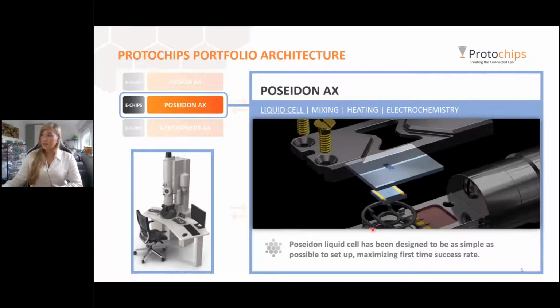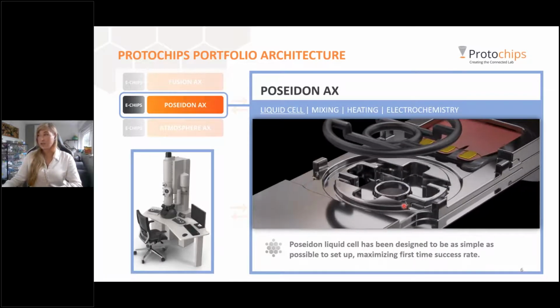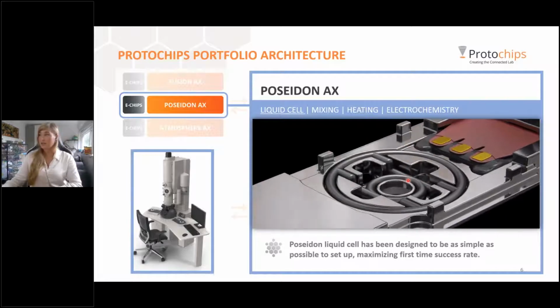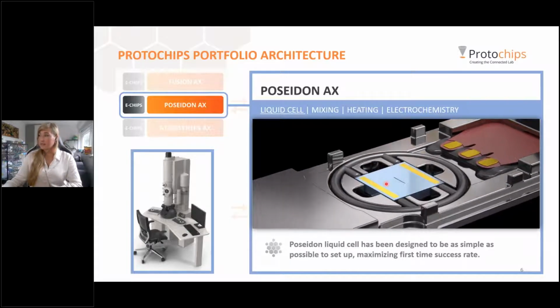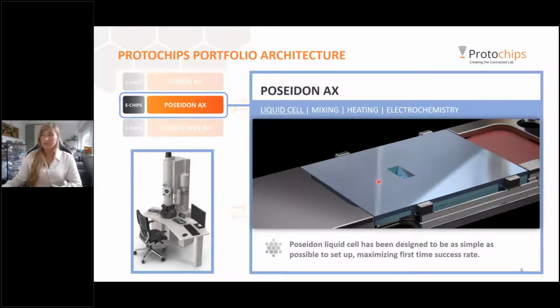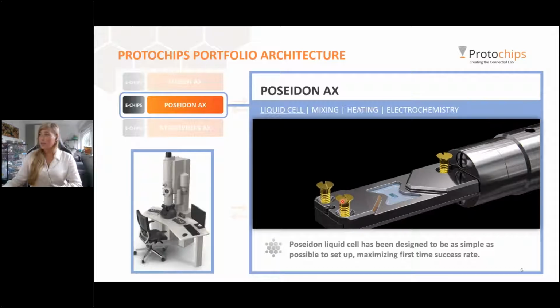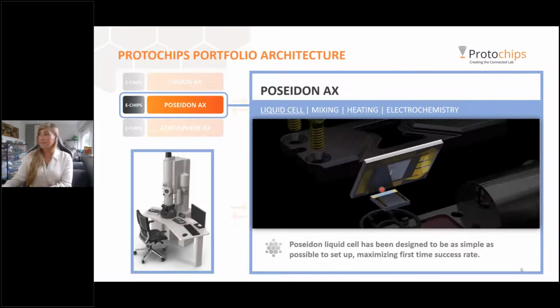And what does it look like when you put this cell together? Well, you can see there's an O-ring that seals everything inside, and then there are 2 of these E-chips, one delivering the stimuli and the other one making sure that you have a complete cell. You will observe your sample through this tiny slit in the middle, which is 50 by 550 micrometers. And everything comes together with a lid and 3 screws so the liquid doesn't come spilling out.